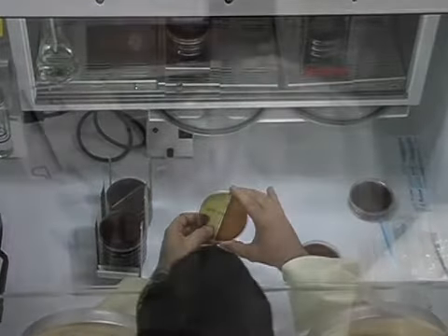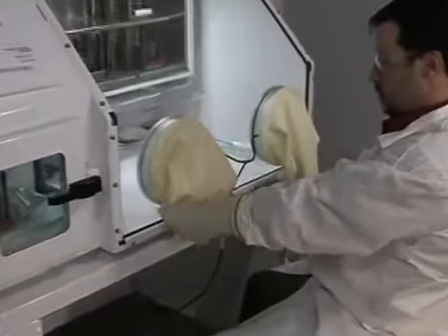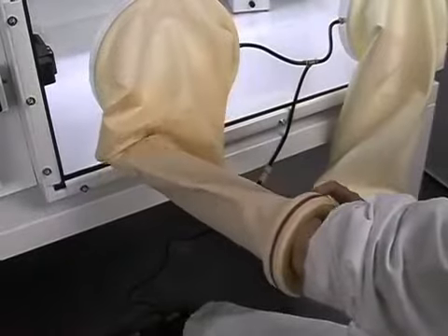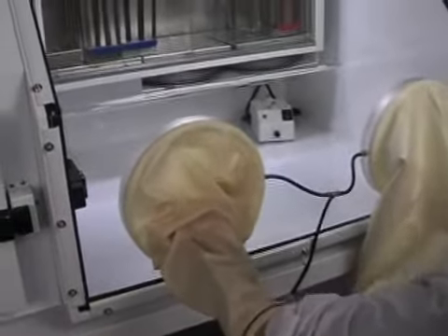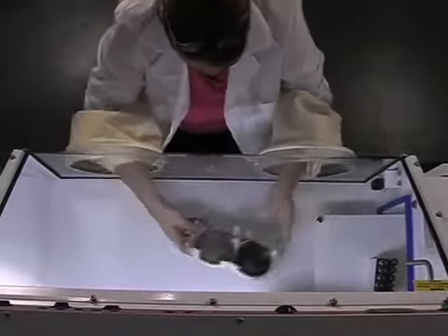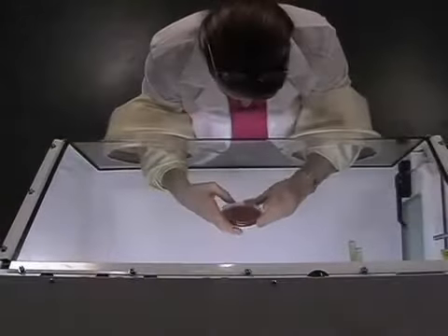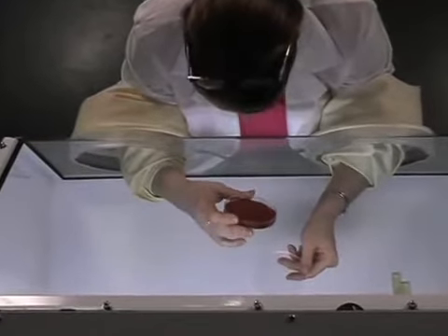This chamber utilizes a glove-free cuff system for handling and inspecting samples. The Bactron was the first chamber to employ a gloveless system, which offers improved dexterity and comfort during operation. These Bactron chambers are also designed with a large open work area that is maintained at a comfortable, ambient temperature. In addition, the condensation control built into this chamber allows for comfortable viewing and work conditions.